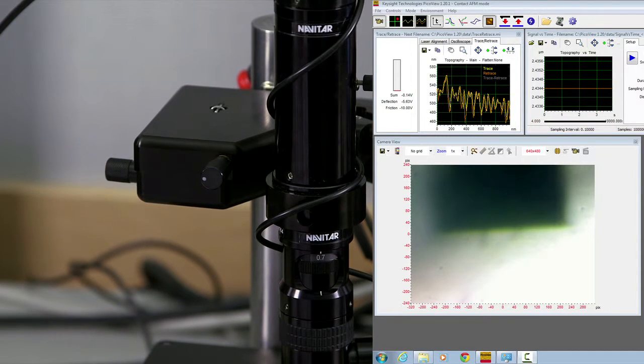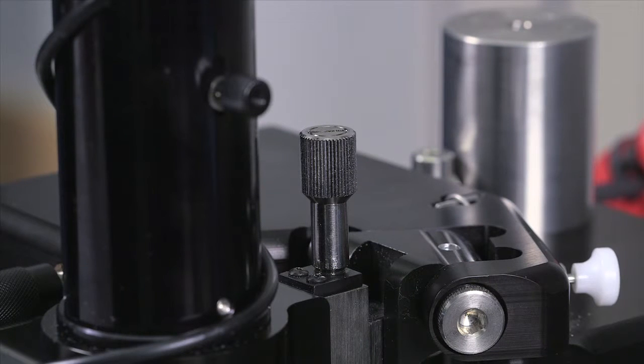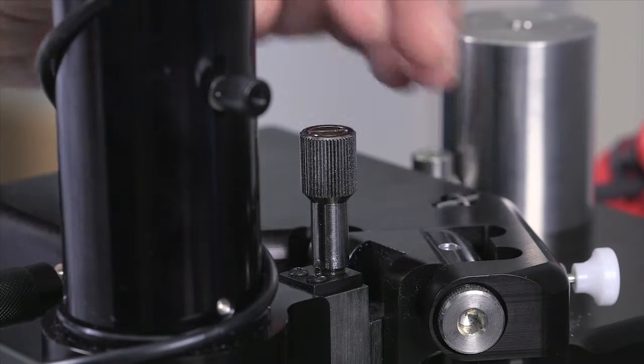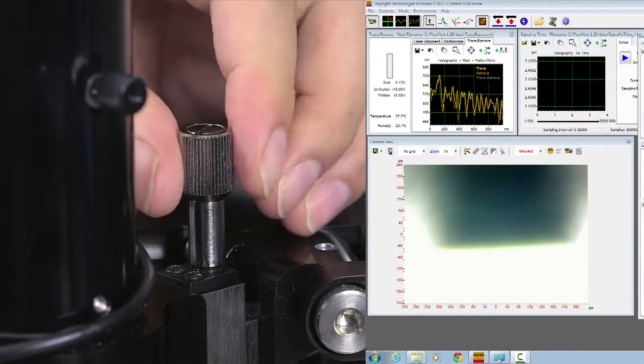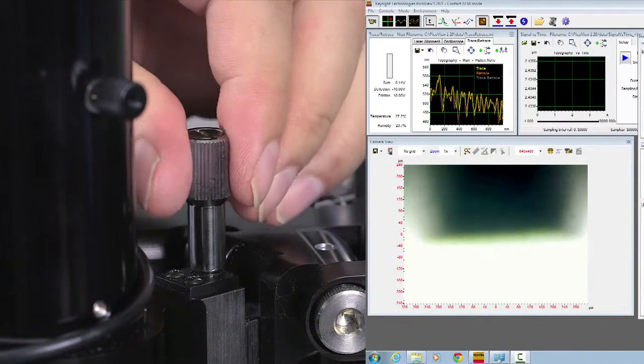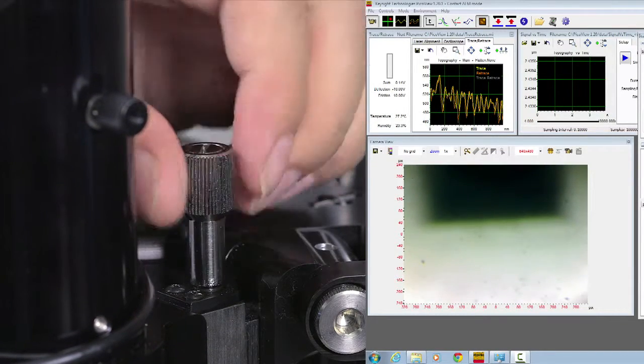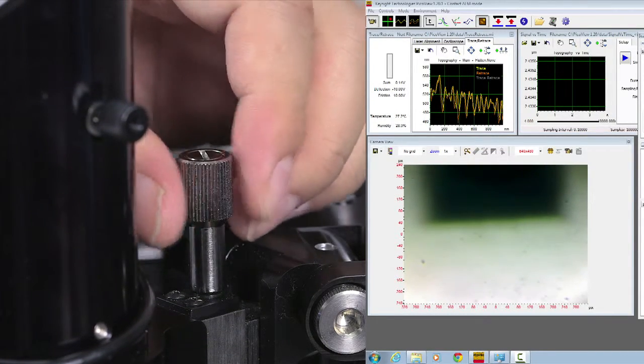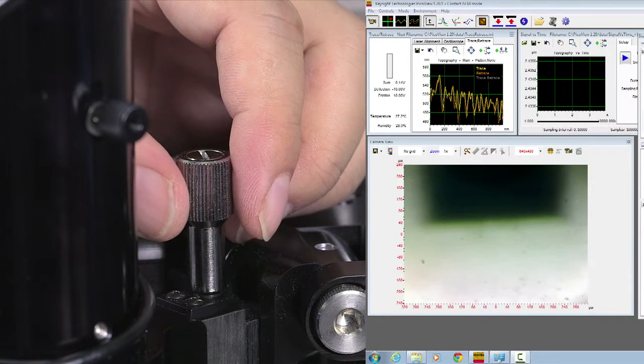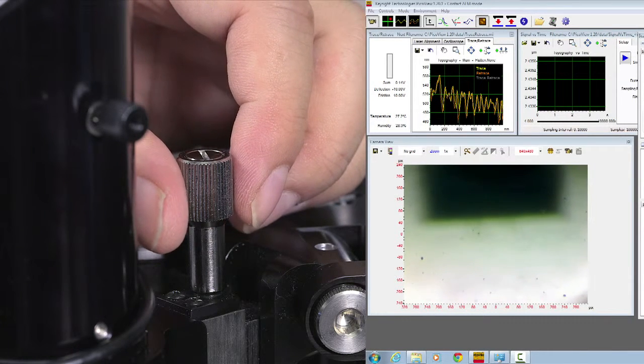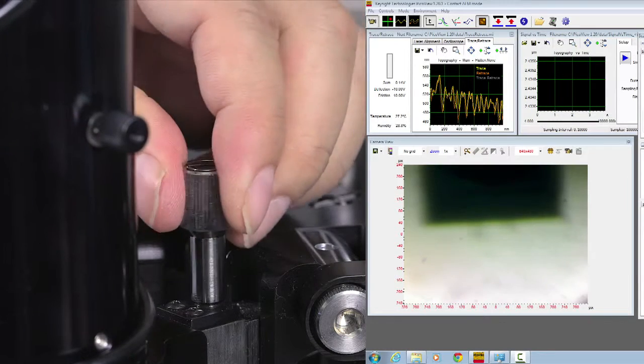Next is the focus. The focus adjustment knob is behind the optical microscope. You can rotate clockwise and counterclockwise to move the entire AFM optical microscope body up and down. Now, when you take that adjustment, also look at the computer screen, the optical view, in order to help you to focus.